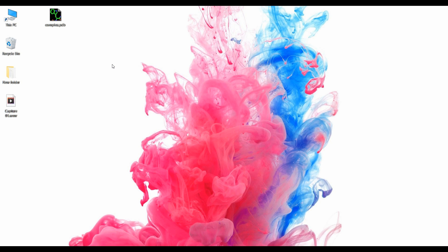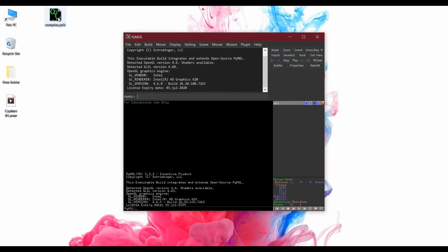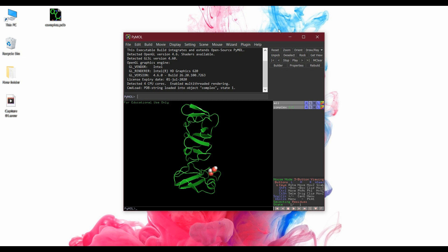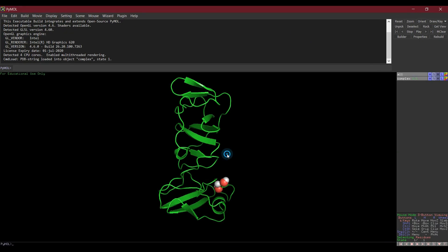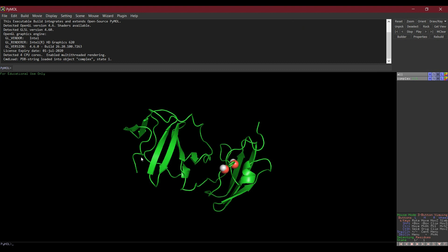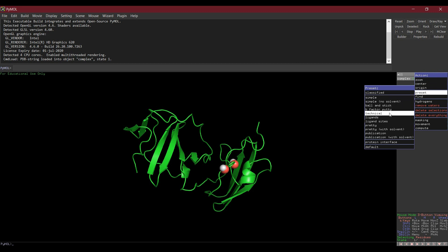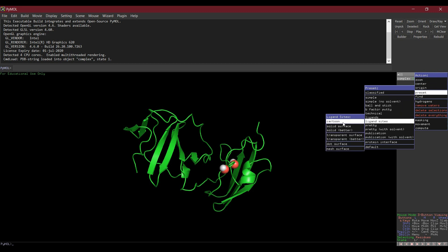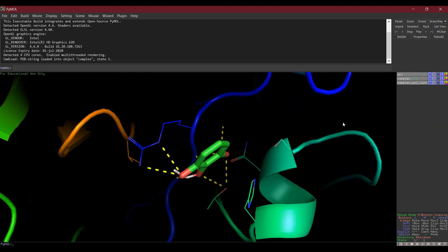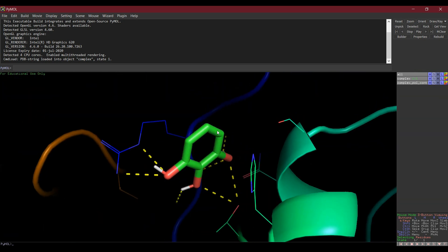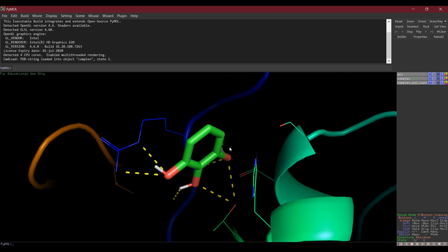We will analyze the complex using PyMOL and Discovery Studio. In PyMOL, with our protein and ligand loaded, go to Action > Preset > Ligand Site, then select Cartoon. This will show the interaction of our ligand with the protein residues.